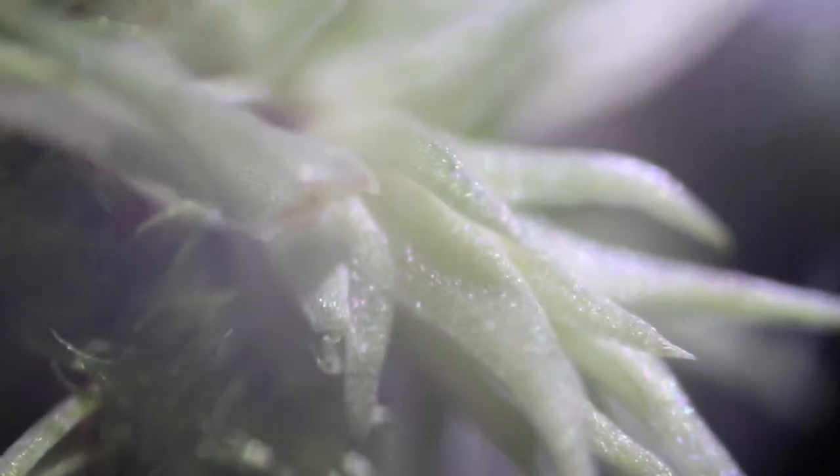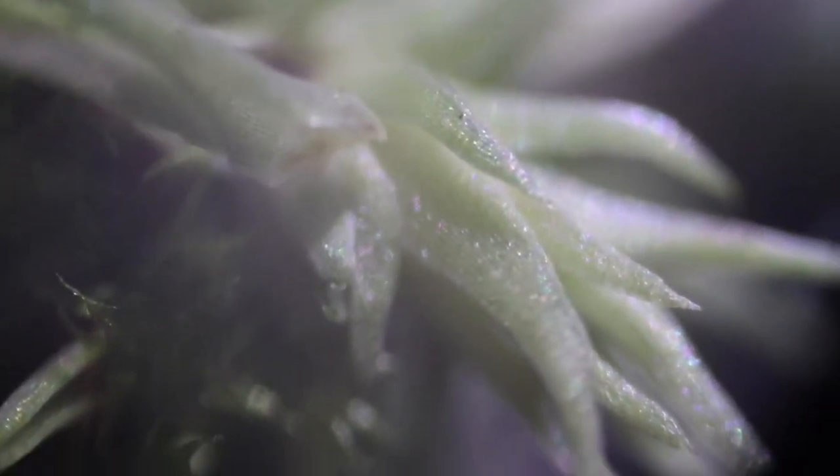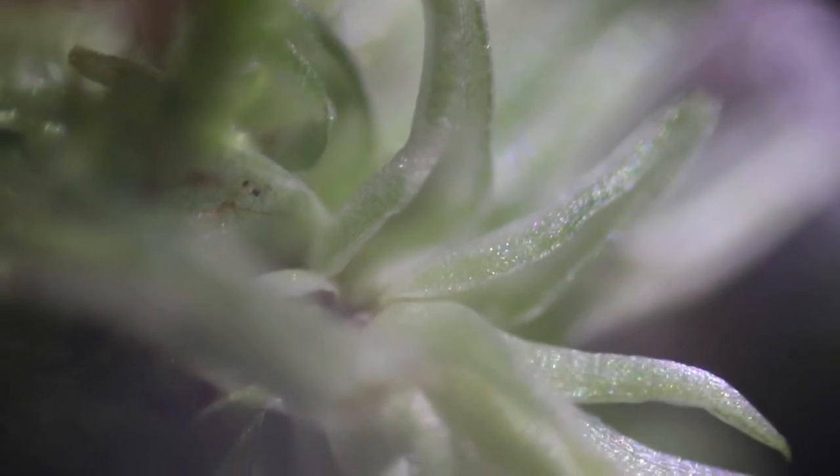This piece is another piece of moss, but it's a different kind of moss. Look at those hairs. I think I have this at the higher magnification. I'm gonna switch the magnification here to a lower one so that we can, there we go, see a little bit more detail. Sometimes your magnification can get too high, so I would just play with it to see what you're looking for. How interesting is that, a tiny little plant. This is a different kind of moss than the moss that we were looking at earlier.